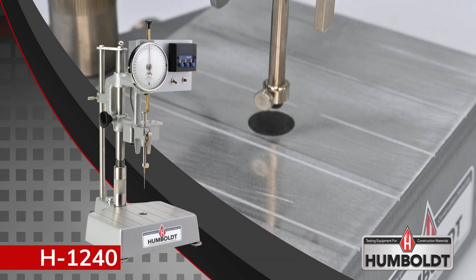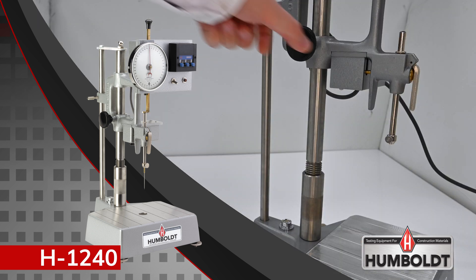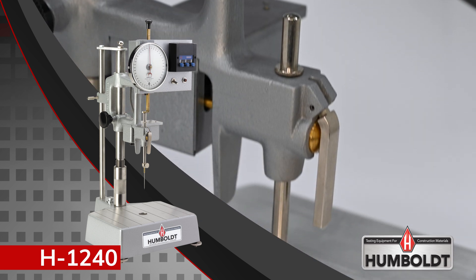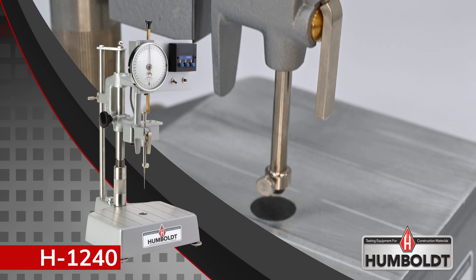They feature an aluminum base with a machine groove table and leveling screws. Two stainless steel rods provide rigid support and smooth up-and-down operation of the cast aluminum head. The head mechanism provides both coarse and fine adjustments and a secure locking mechanism to ensure the correct needle height for testing.